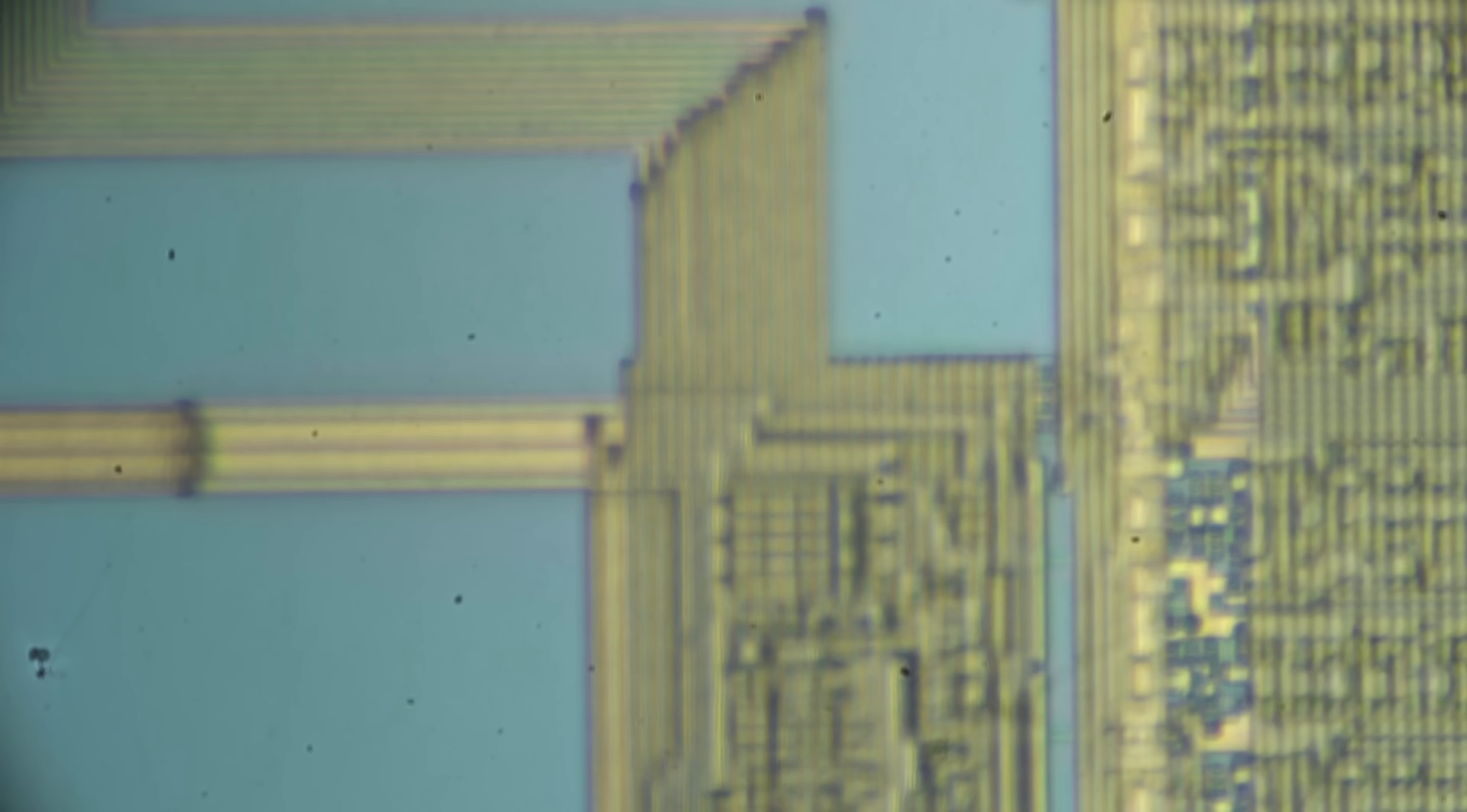We can use a different instrument, an atomic force microscope, to understand how tall these aluminum interconnects really are. This instrument scans a tiny probe across the surface, collecting height information which can be converted into a three-dimensional model.